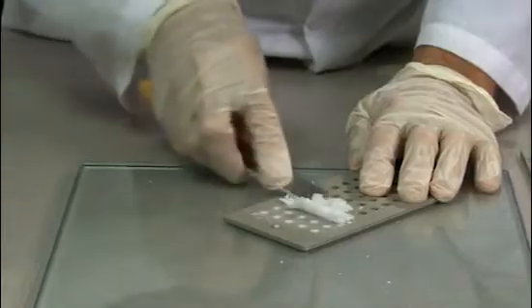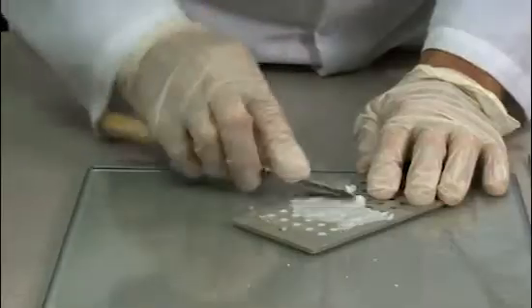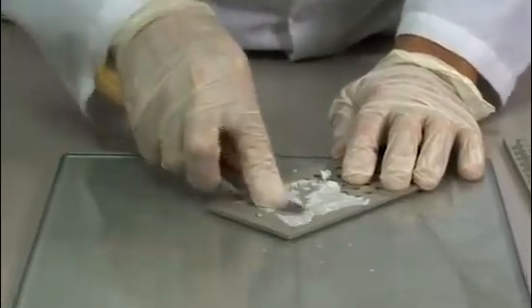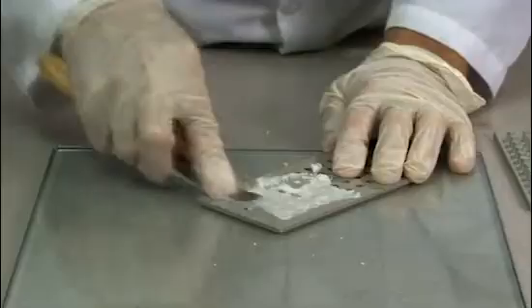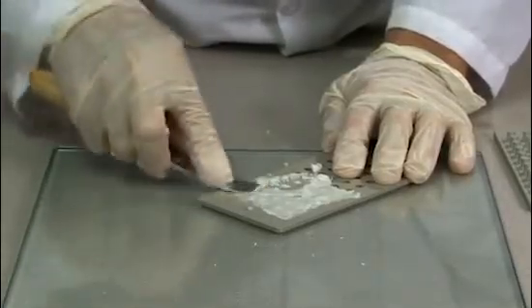The amount of material in each of the holes is determined by how tightly you pack the hole. Therefore, use a very strong pressure and fill every hole to its maximum capacity.